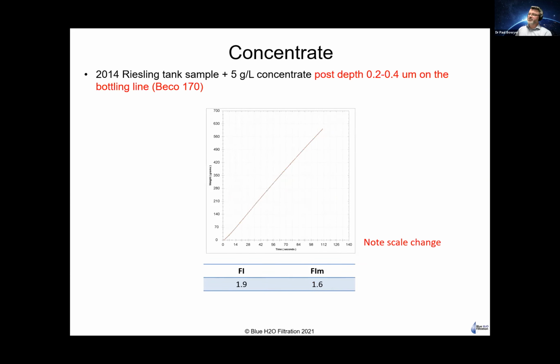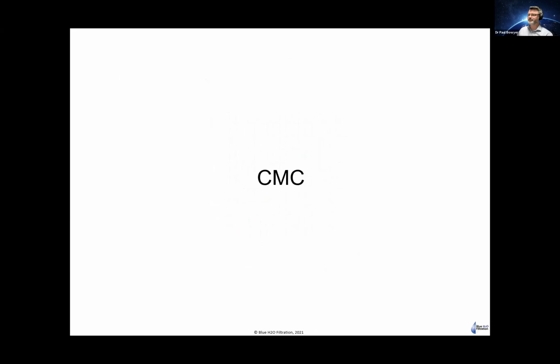But importantly, it was sampled after the lenticular phase, but before the 0.65 membrane pre-filters. And what was coming out of those lenticulars was clean as a whistle. So in this case, the lenticulars were taking all of the load and generating a very clean wine onto the following membranes, which is what you want to happen. But if the colloidal material in that wine is sufficiently fine, it will go through the lenticulars and either hit the 0.65 or the 0.45, but they were lucky in this case.